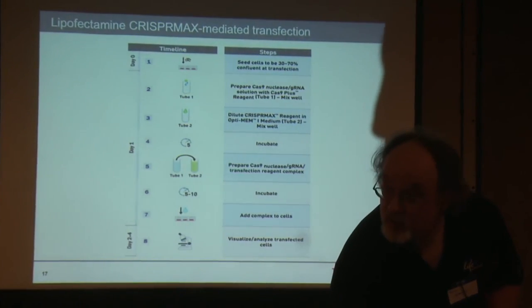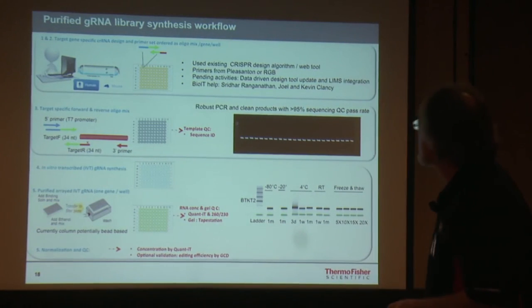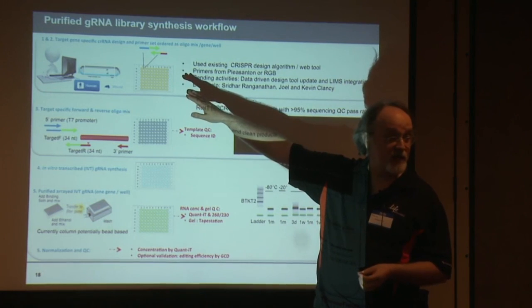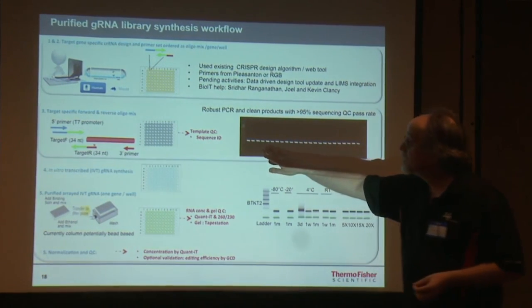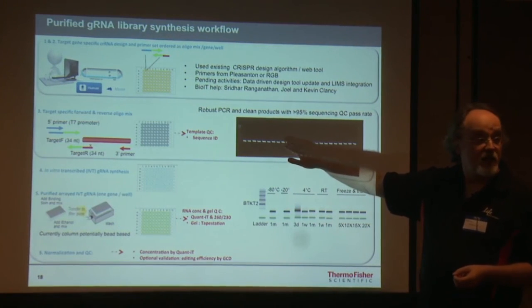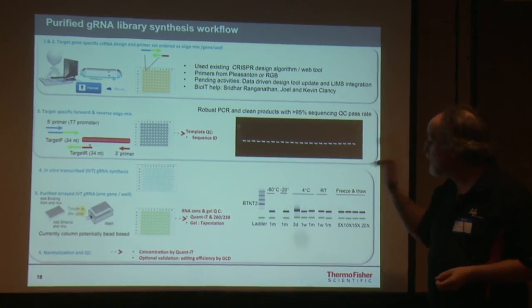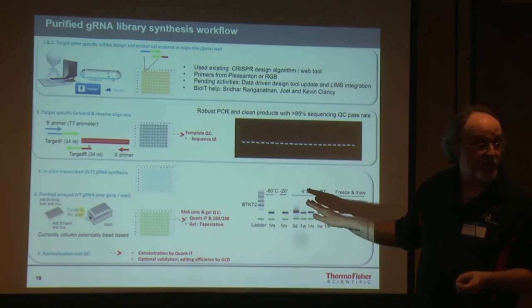And again, we're using software throughout this. Where software is important is in the process of being able to manage all of our designs, and which cell was hit by a particular experiment. It's in the process of actually seeing, did we actually get a guide RNA? Is it amplifying correctly? And more importantly, once we actually go to do the experiment, does the experiment actually work?